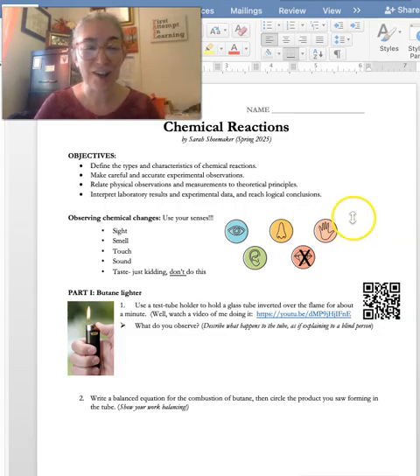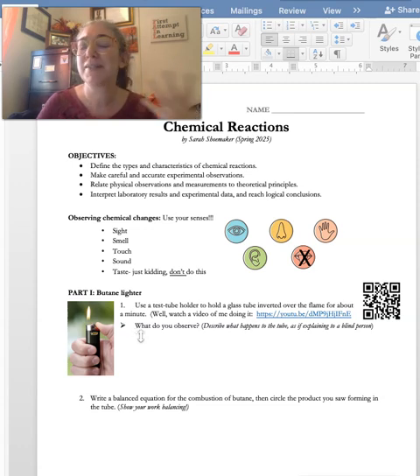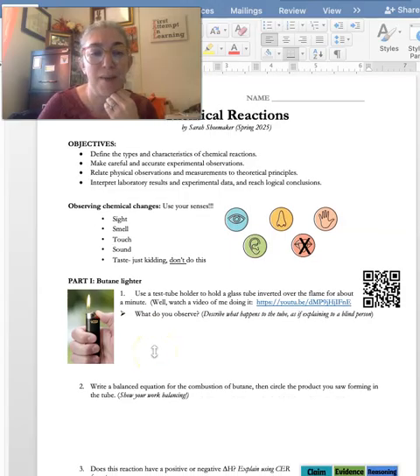Since this is an online class, I will be performing these labs, these reactions, and you will watch videos of me demonstrating them. So really the things that you will be able to use are your sight and your sound senses in order to make observations, and practicing writing descriptive observations. I like to say that when you watch me perform the reaction, what you're observing is how you would describe what's happening to someone who's blind and can't see. So describe it in enough detail that they can understand what's happening.